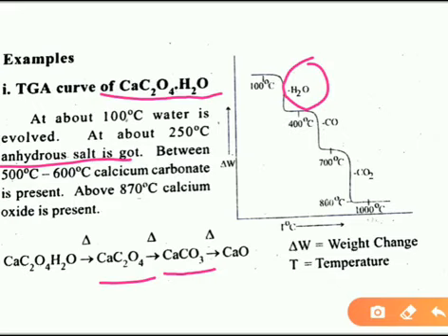And above 870 degrees Celsius, it gives calcium oxide.